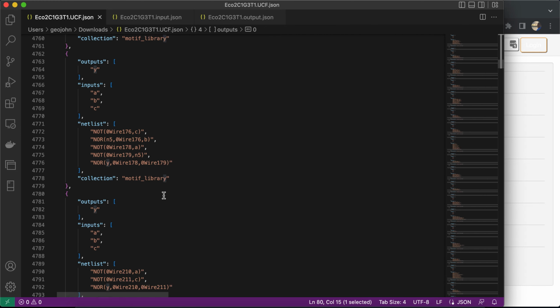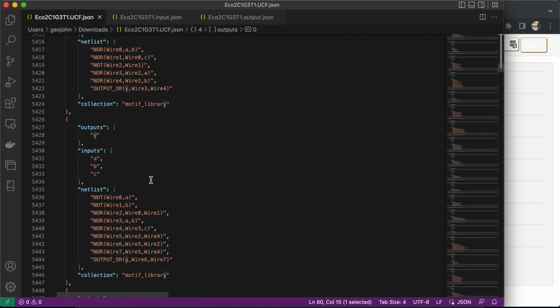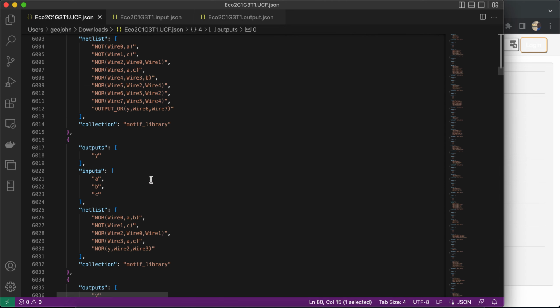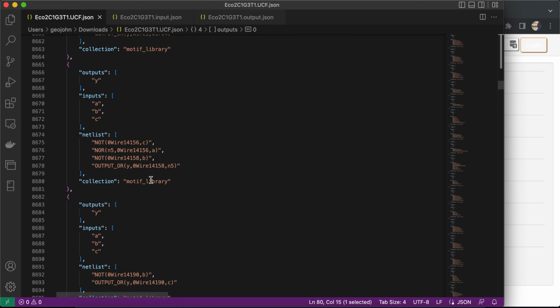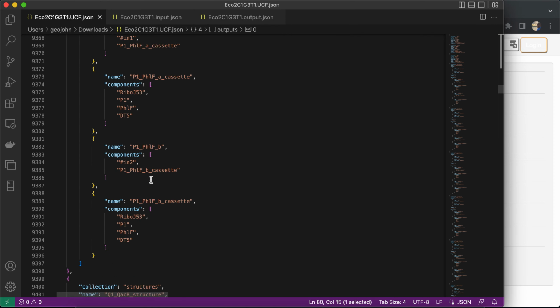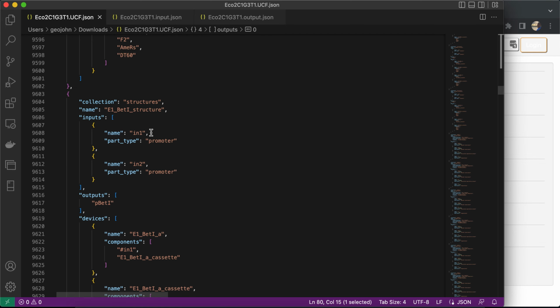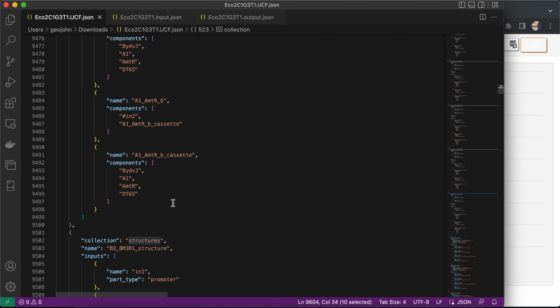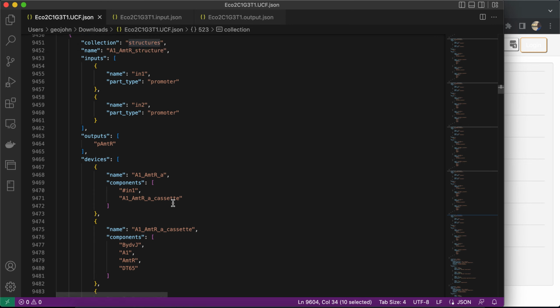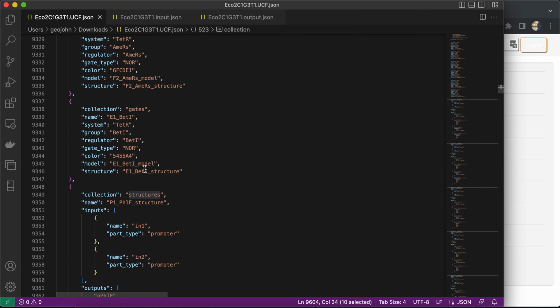This is why it takes so long to really get through this and have somebody generate a new organism for going through Cello. It is an adventure to say the least, and I admire anyone who can go through this from both the technical perspective and the scientific perspective. But we went a little bit too low, it seems, as we passed up these motif libraries and we started to hit structures. So I can just discuss these structures as we've hit them. I wanted to make sure we didn't miss any sections before the structures started to appear, where we were scrolling a little fast.